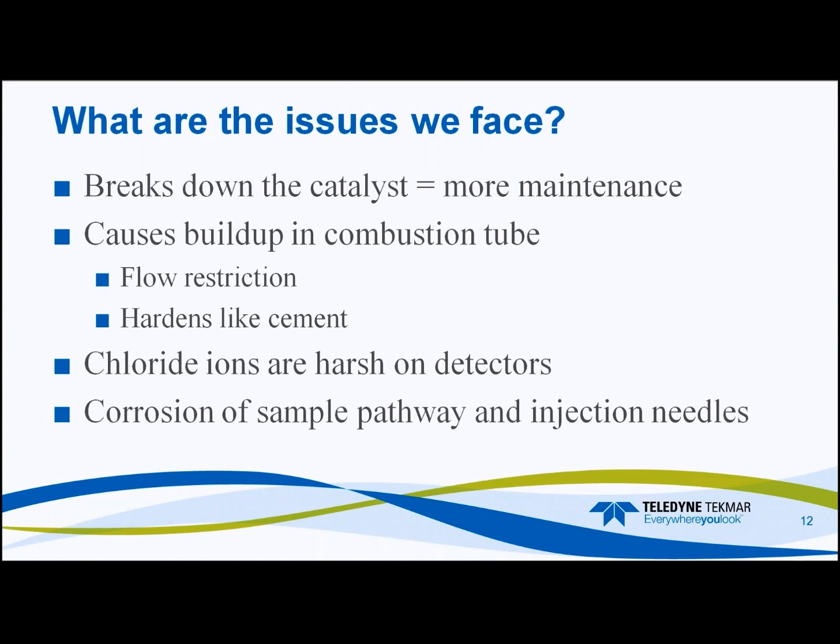You'll start to see problems with your reproducibility. You may even see problems with peak shape. Sometimes with salt samples, you'll see the inevitable, what we call the camel or the humpback, and you'll see that double hump peak coming off of there.